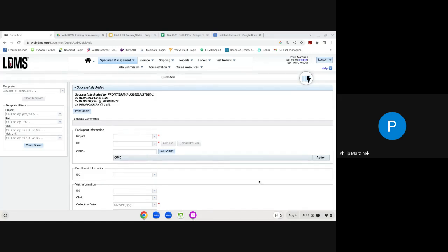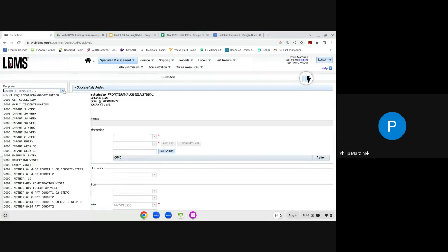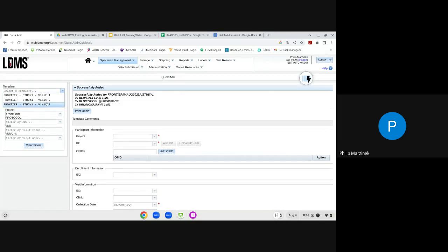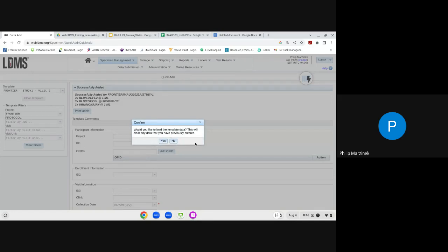Verifying labels before adhering them to specimens will benefit storage, the QA/QC process, and shipping, and will help prevent issues with receiving laboratories using barcode scanning to confirm imported specimens. The next method to add specimens is using a Quick Add Template, which predefines information on the Quick Add screen. Use the project filter to narrow the template list, then select your template from the drop-down — for example, the Visit 2 template. Click Yes when asked if you want to load the template data.